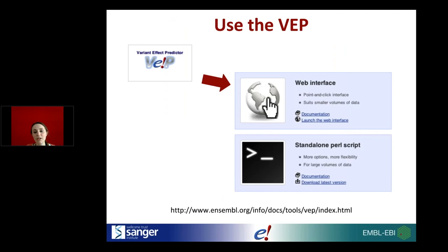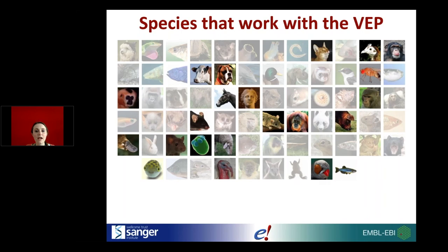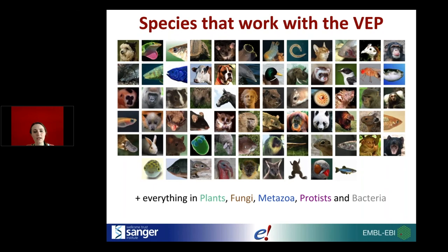The VEP is what you use for this. I'm going to show the web interface today, but there is also a standalone script you can run without any coding — just commands in the command line. The script is more suited to larger-scale analyses; you can put millions of variants into the web interface but it'll take a really long time, so for that I'd recommend the standalone script. Every species in Ensembl will work with the VEP regardless of whether there's known variation data — it compares variants to genes.